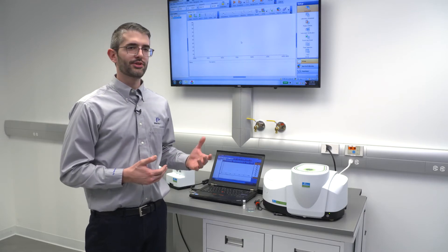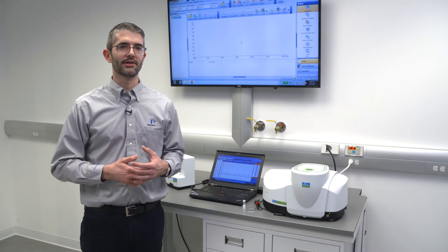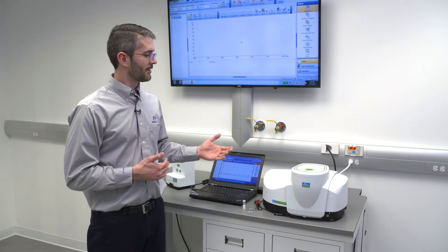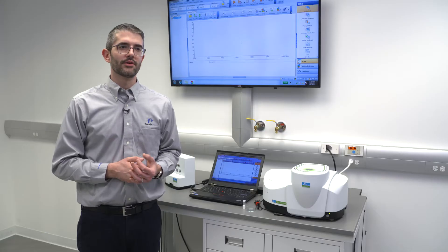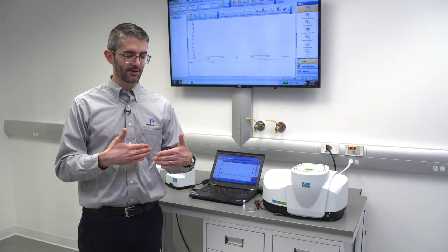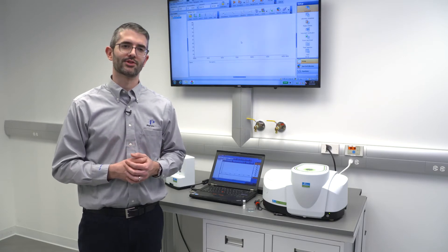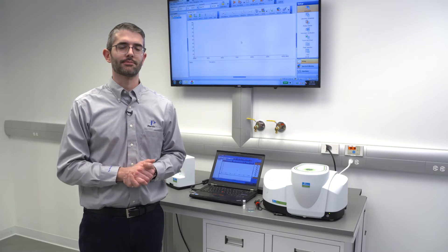The Spectrum 2N FT-NIR benefits from many of the technologies we have employed over the years, including the DynaScan interferometer. The DynaScan interferometer changes optical path difference through the system for measurement of the interferogram. But unlike traditional interferometers, this system employs a two-mirror arrangement. These two mirrors are cemented on a pivoting assembly, which rotates to change the optical path difference.